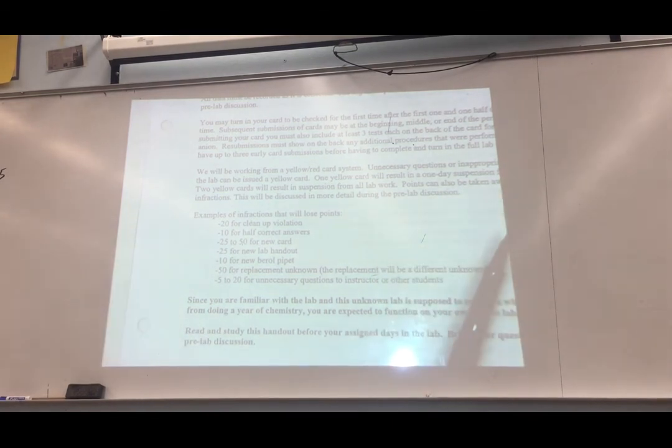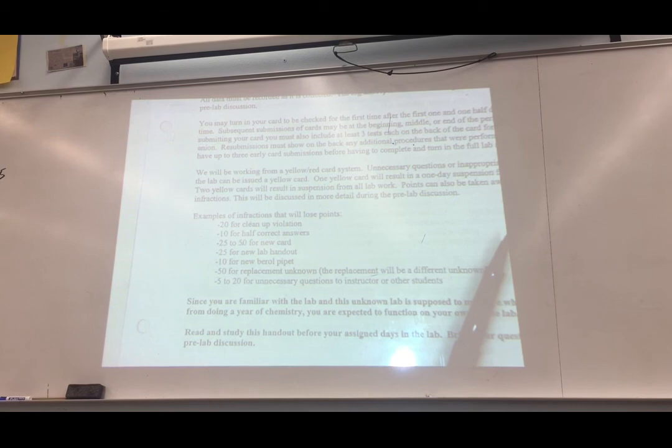Your unknown is on the table. Now, you either have to be very good with your dropper and slurp it all up, or you get a new unknown. I'll be glad to give you an unknown, 50 points off. And the unknown will be different. Now, where this comes into play is you've got enough unknown in that test tube to do 2 of every test in there, if you are conservative. If you're not conservative with your unknown and you're just squirting it everywhere, you're going to run out of unknown.